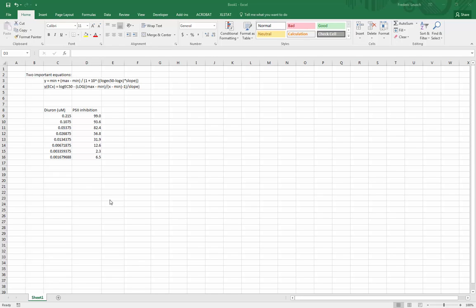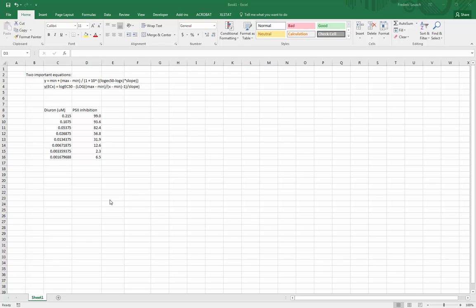Okay, this tutorial is to show you how to use nonlinear regression to calculate an EC50 or an EC10 value from a sigmoid dose response curve or concentration effect curve. There are other methods to linearize the data so you can use linear regression like probit or logit or arcsine transformation, but what I want to show you is it's actually quite easy in Excel to do nonlinear regression. We'll do nonlinear regression here using an approach called least squares regression.